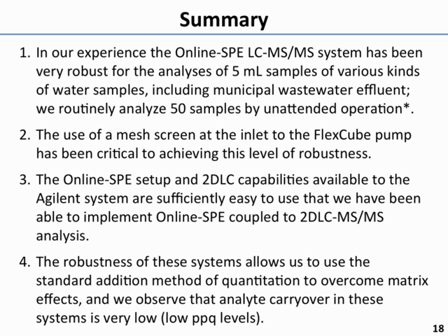Again, installation of this mesh screen has been really important to achieving that, and the 2 capabilities, the online SPE and the 2DLC, are sufficiently easy to use that we've been able to couple those ideas pretty quickly. And like I said, we're very happy with the carryover, and the robustness of the system allows us to do standard addition for quantitation routinely.